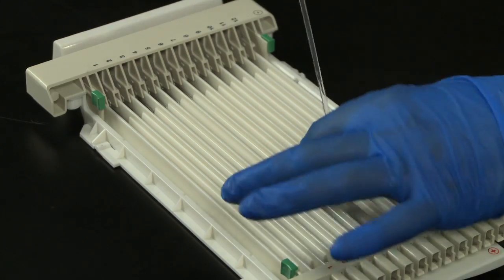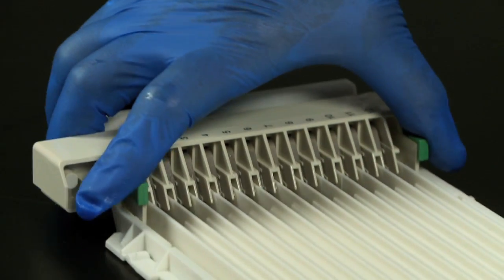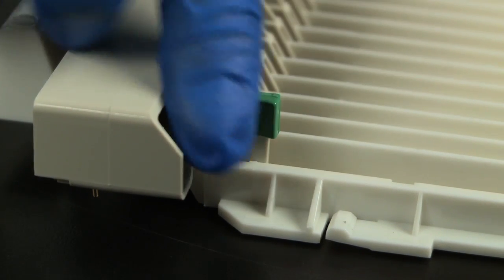Remove the IPG strips. The electrodes can be removed from the tray by pinching the green tabs and lifting up.